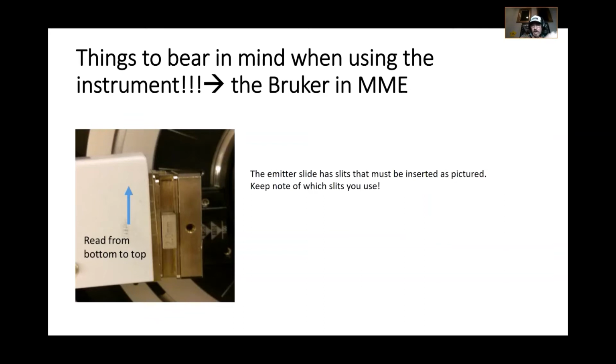You can also change the speed at which the arms move, and that actually has an effect on your data as well. Slower scan, again, higher resolution. Faster scan, you get it done quicker, but you're losing resolution that way.